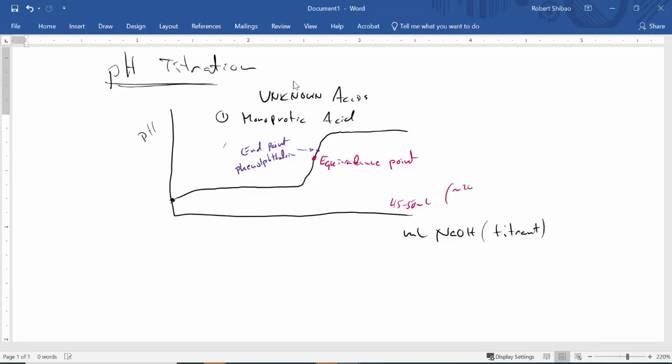There's roughly about 20 drops per milliliter. And so if we did all 50 milliliters, 20 times 50 would be 1,000 drops. And if you take about a minute for each reading, that would be about 1,000 minutes.